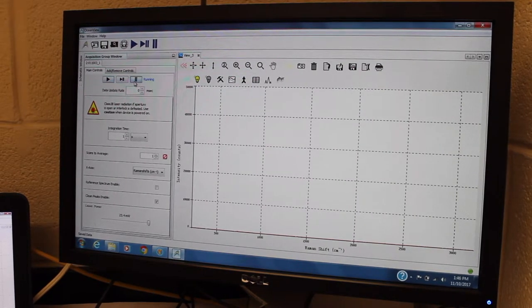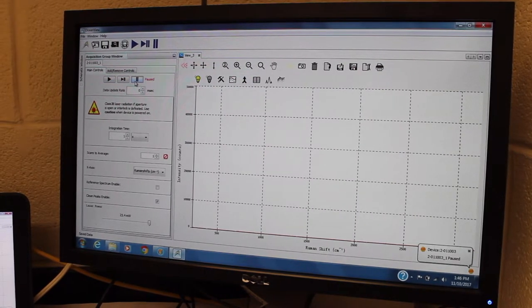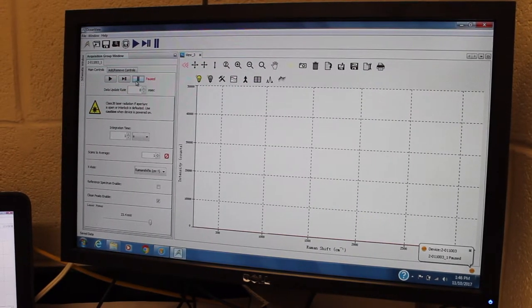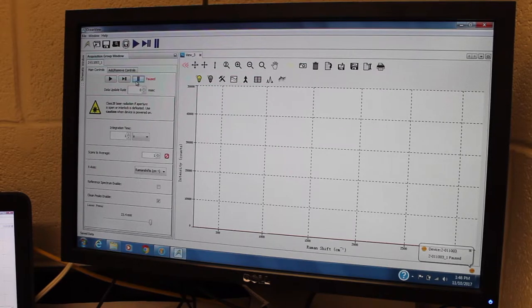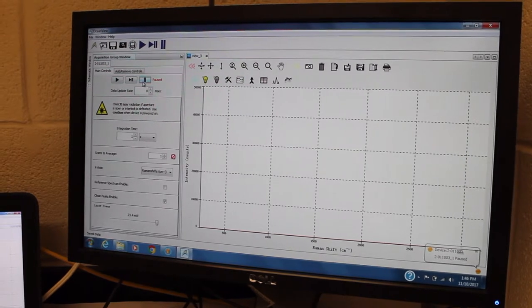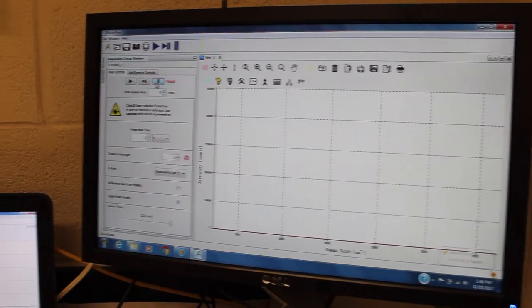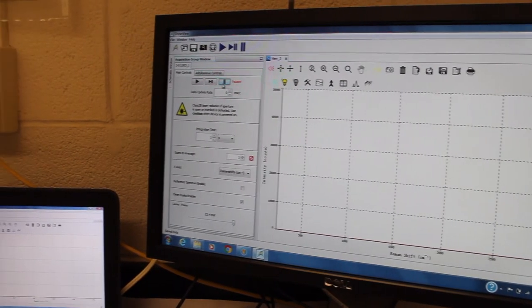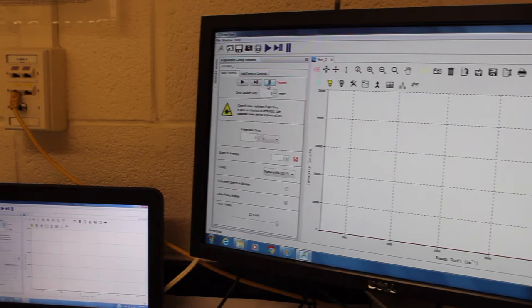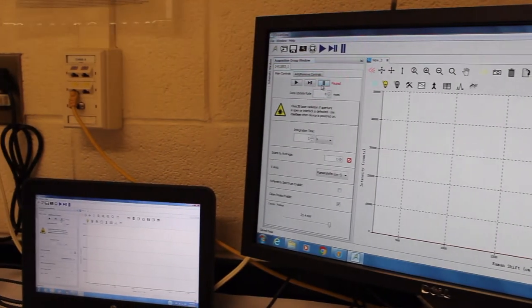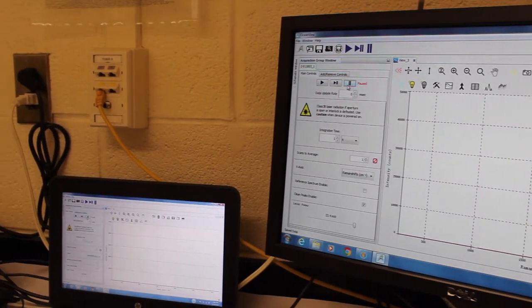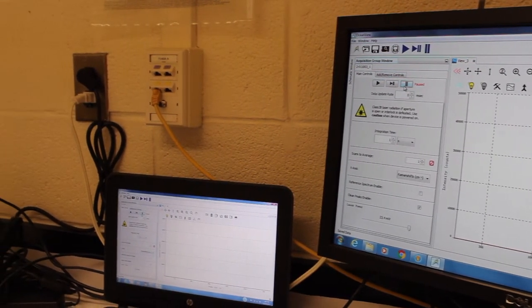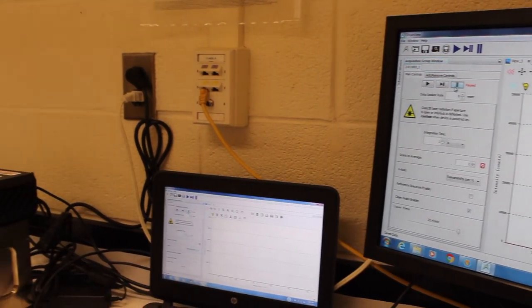Well, something must be wrong with the way that I've set up the sample. The first thing I should do before blaming it on the sample itself, maybe in this case it's not a flat surface or something like that.